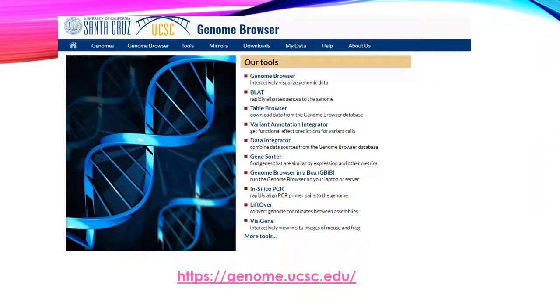Another very useful browser for online analysis is the University of California, Santa Cruz UCSC Genome Browser, available at the provided link. This genome platform offers a multiplicity of tools for analyzing your bacterial genomes.